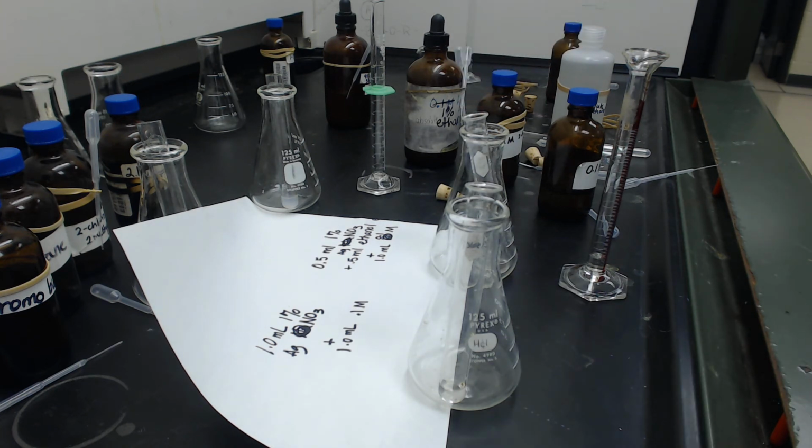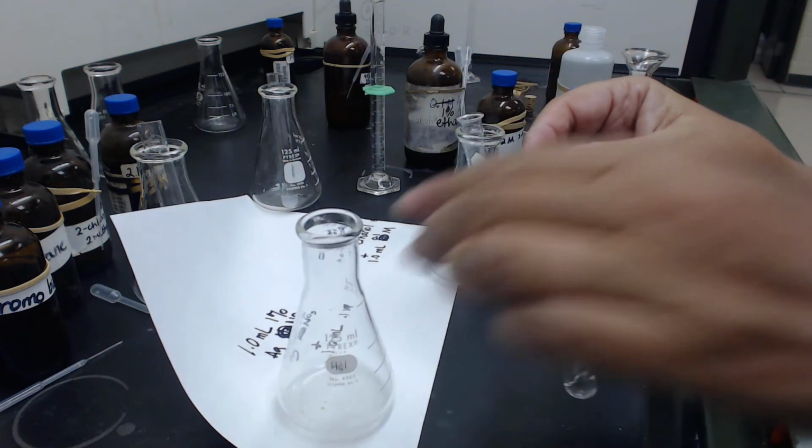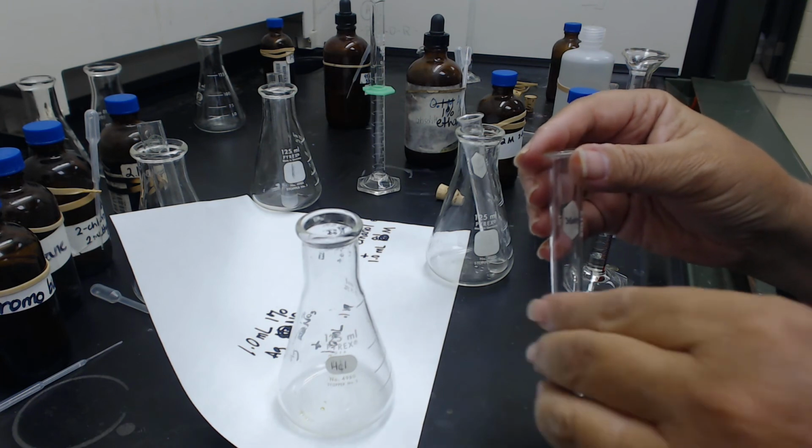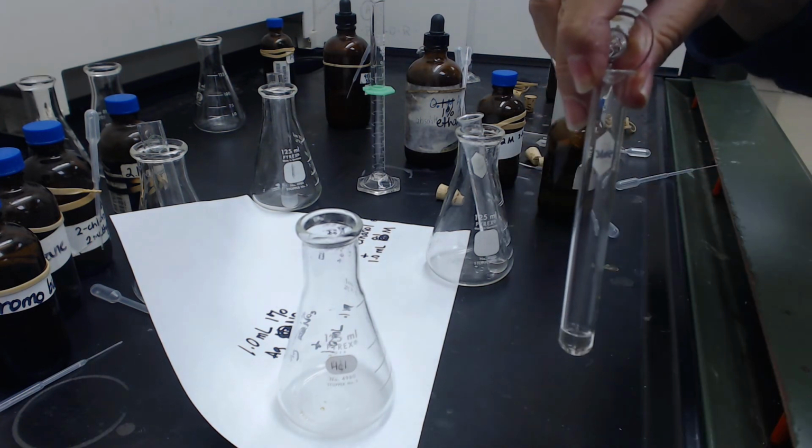Now I'm going to add a milliliter of 0.1 molar 2-bromo-2-methylpropane into each of them. This time the concentration of the silver nitrate is changing. I'm going to do them one at a time again like I did last time, start it and time it at the same time, and we'll see which one goes faster.